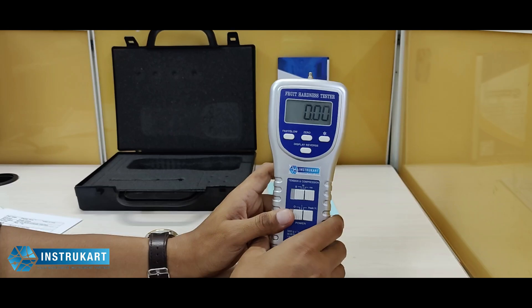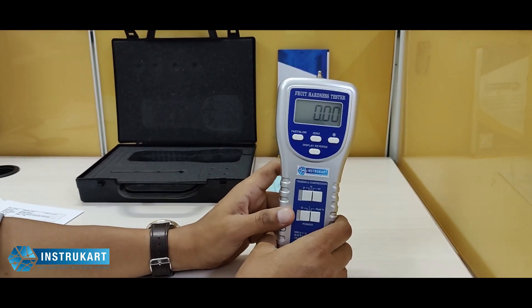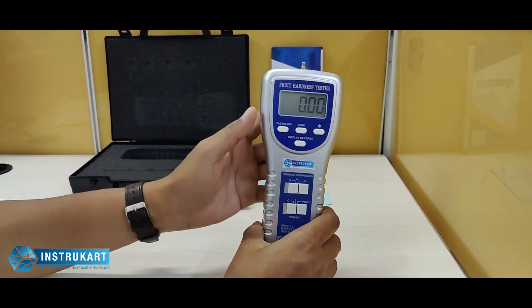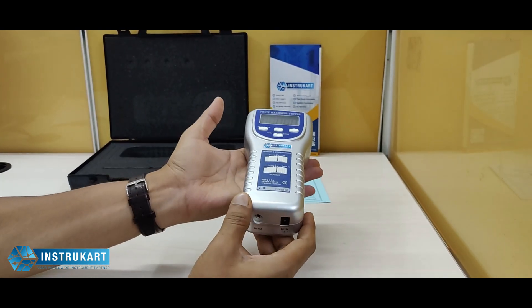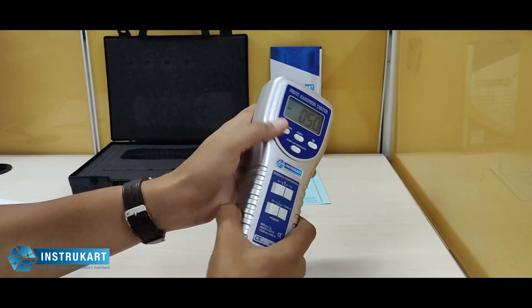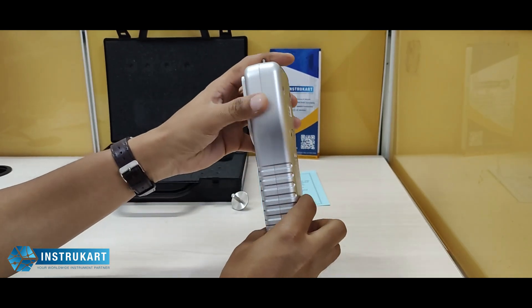It has an exclusive load cell as a transducer, and the overload capacity is approximately 7 kg. The full scale deflection is approximately 0.2 mm maximum. It weighs around 650 grams and also comes with an SD card option should you require it.